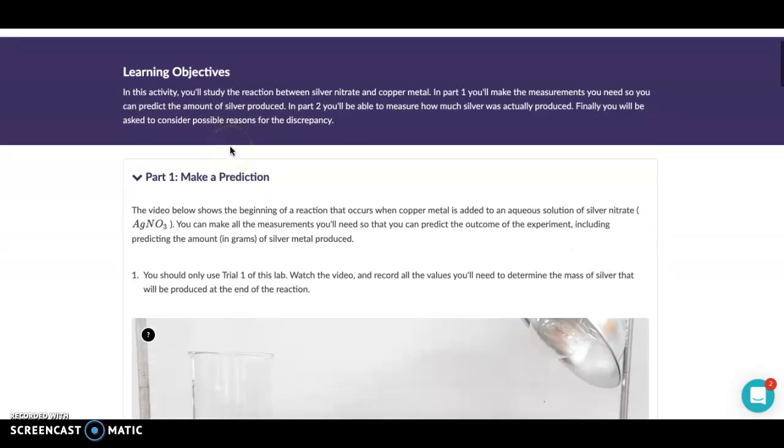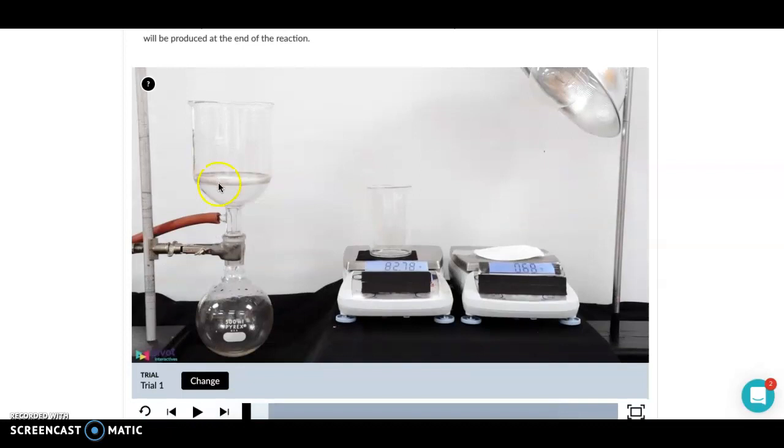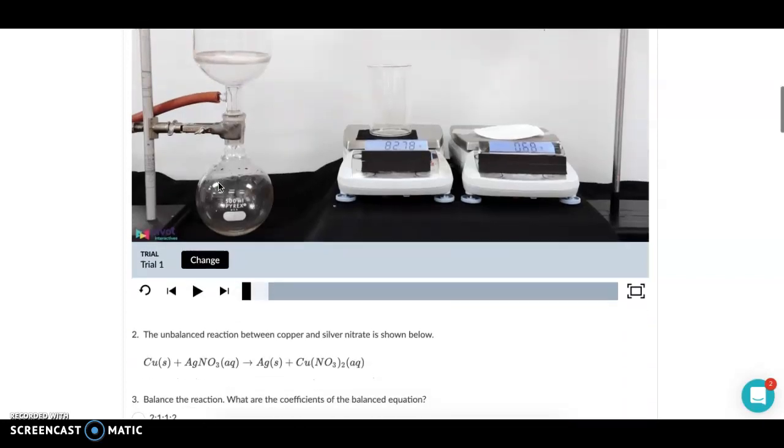In this lab, you start off by part one, making a prediction. This is the majority of the lab. Make sure you watch this video and focus on trial one. There's no need to go to any of the other trials. Just focus on trial one for this lab.